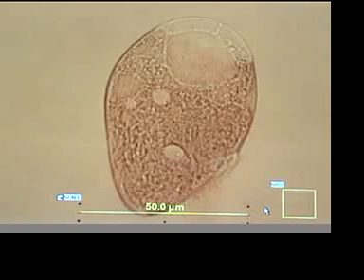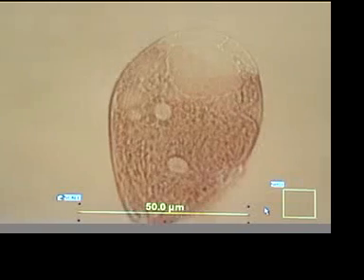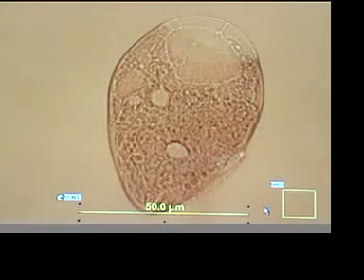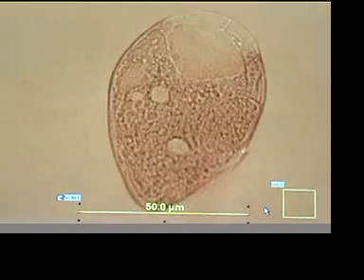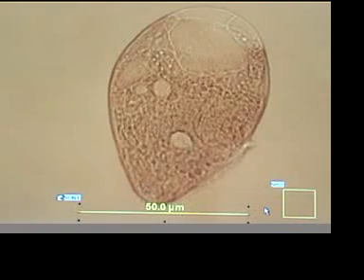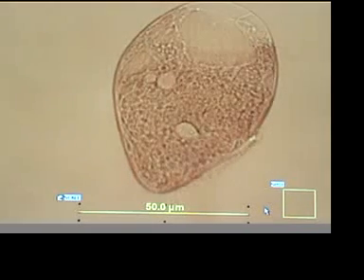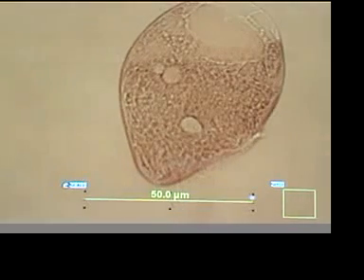It's almost too big to fit on the computer screen here. And we'll just patiently watch. This is happening in real time. This is an Olympus BX60 microscope. You see a little bit of movement here. And this is with the 10x objective. And the scale you're seeing in the picture is accurate.